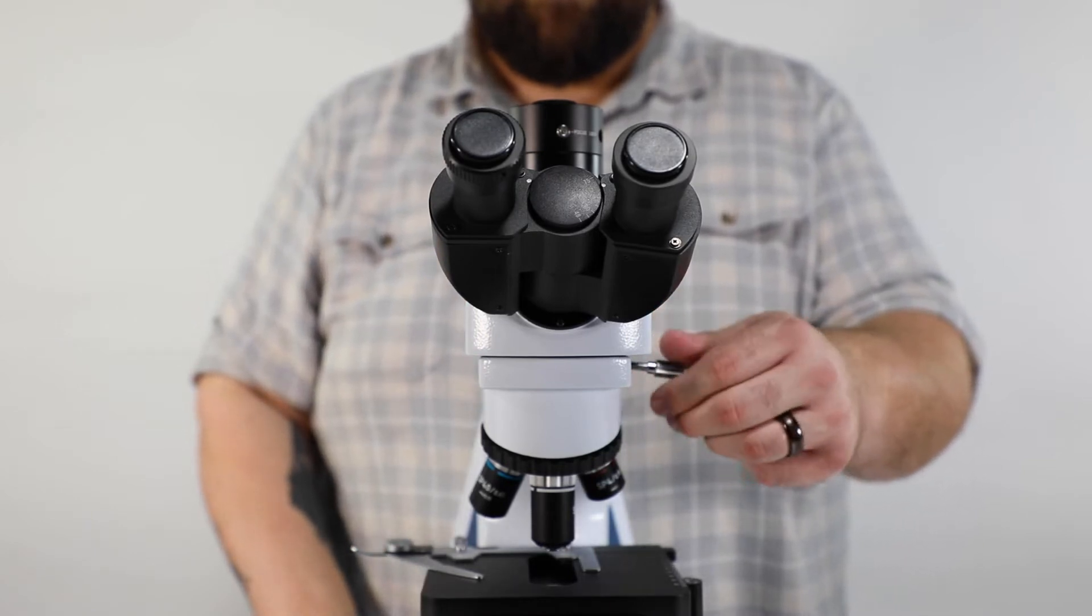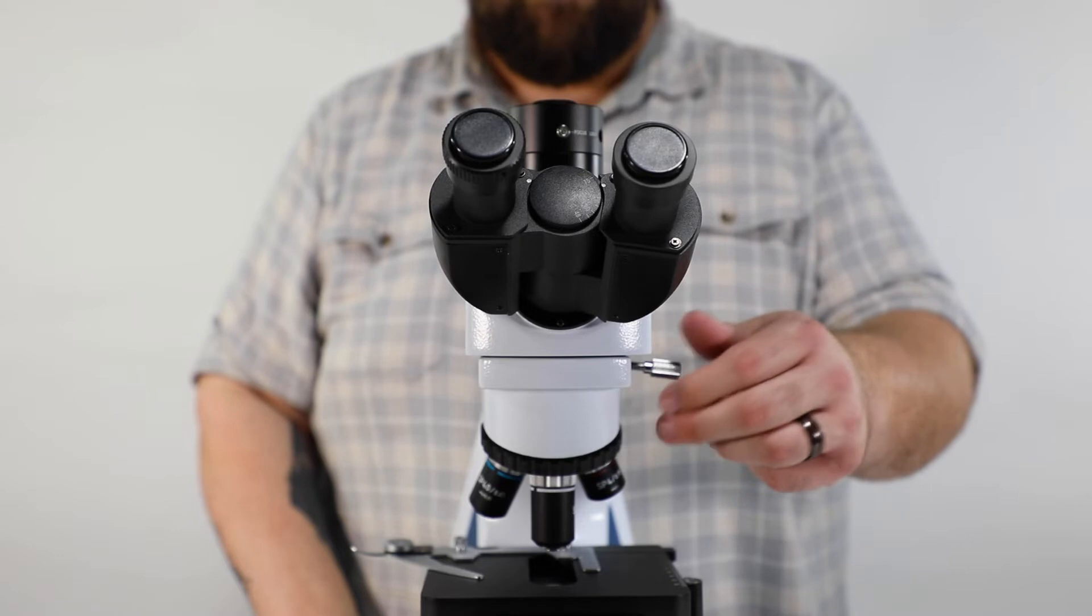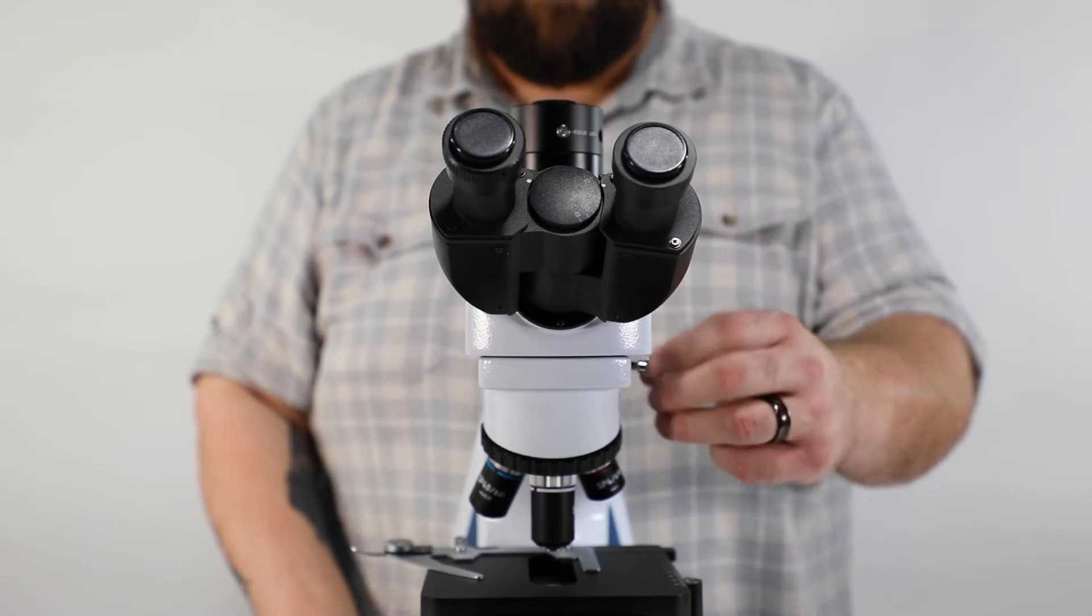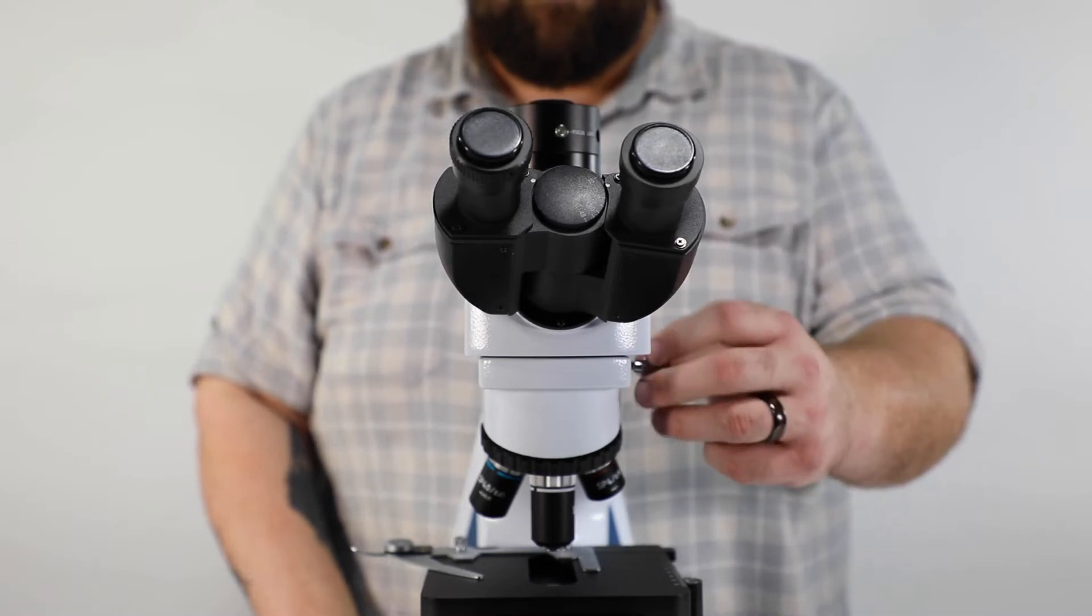Once the head is successfully placed in the port, turn the head 90 degrees so that the eyepiece slots are facing you again. Finally, tighten the thumb screw until the head is secure on the body.